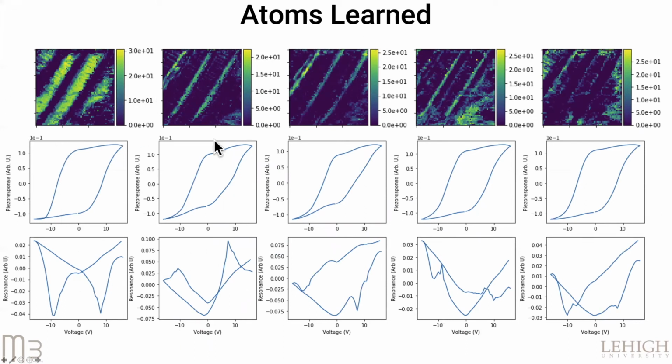is that the first 2 endmembers look like classical ferroelectric switching with resonance behavior that looks like softening and hardening. This second feature shows a little bit of concavity in the piezoelectric hysteresis loop and a hardening step during ferroelectric switching, which is associated with a 2-step, 3-state ferroelastic switching process from C to A to C. If we look at the other atoms, however, we don't see any clear physics behavior that we can commonly interpret.